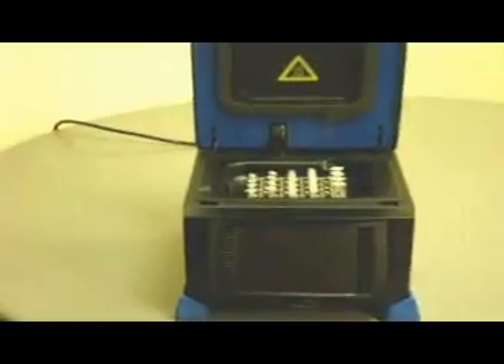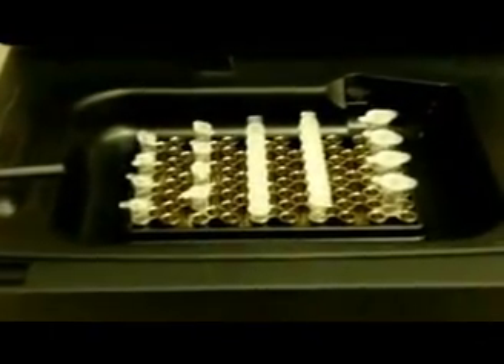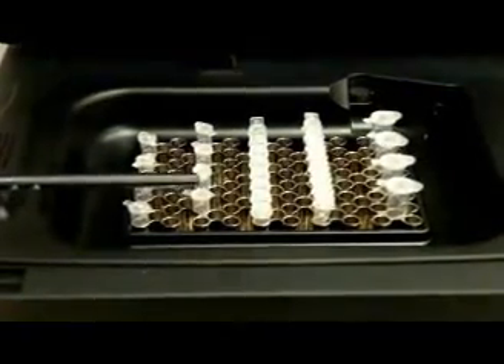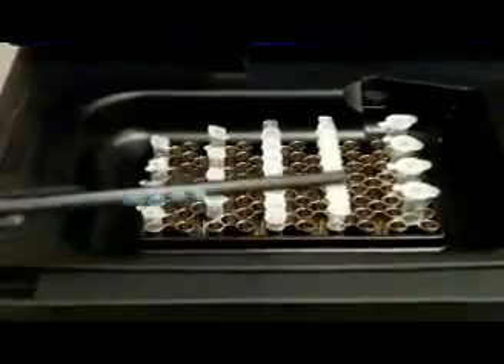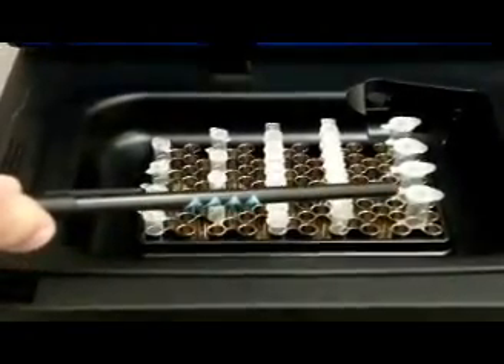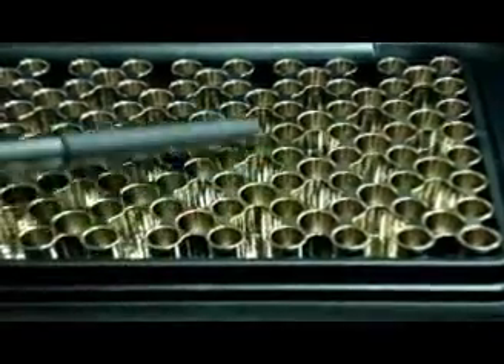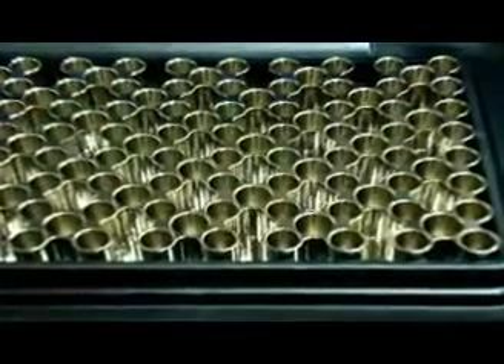The A4 comes standard with the combi block. The combi block is designed to accommodate either 0.2 tubes domed or flat capped, 8-strip 0.2 tubes, or the traditional 0.5 ml PCR tube. You'll notice the honeycomb construction of the combi block, which is designed to prevent use of a 96-well plate — it will not engage.